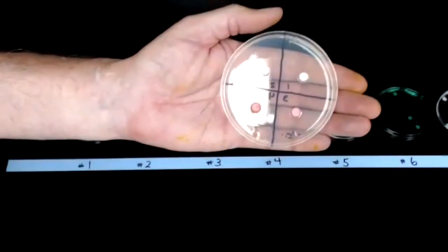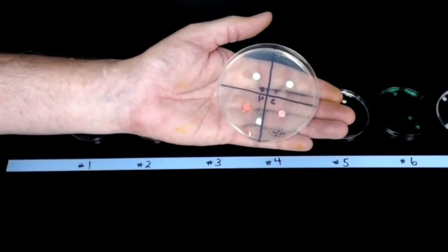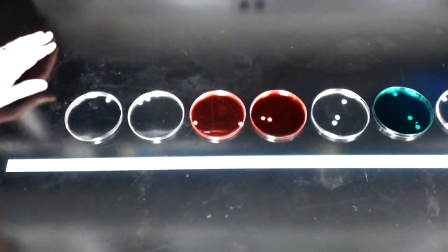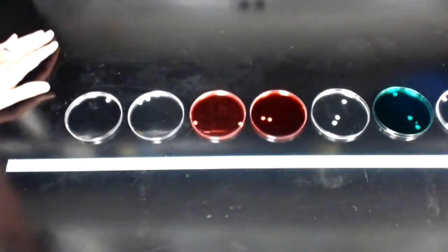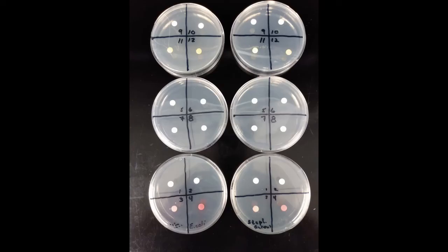So hopefully now you can see that all 4 discs have been successfully transferred to this first plate of E. coli. And I'm simply going to do that sort of transfer of discs for all the plates from all the disinfectants and antiseptics.